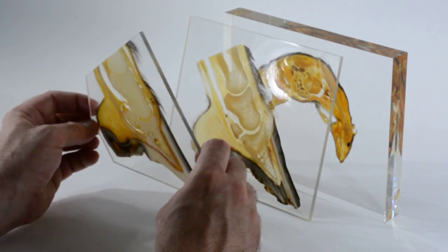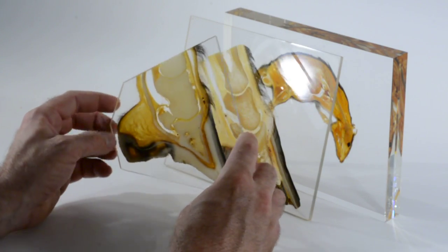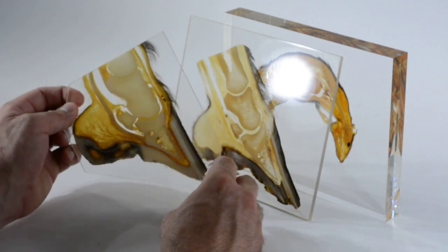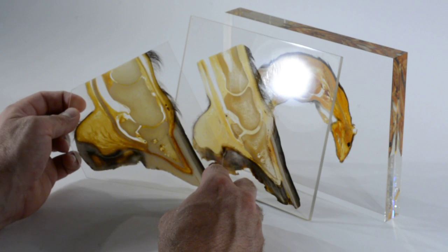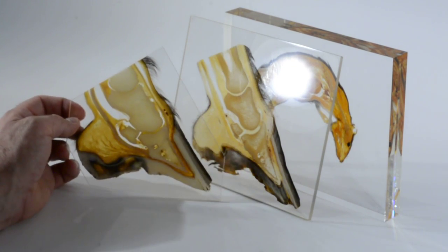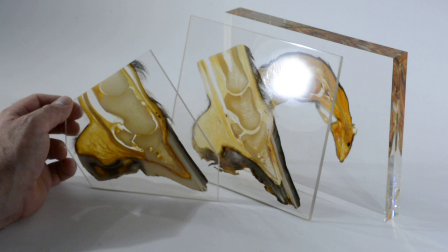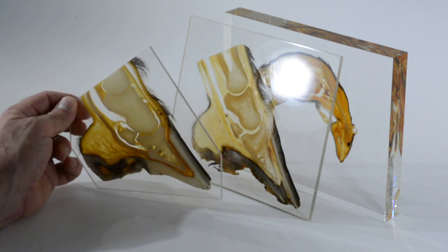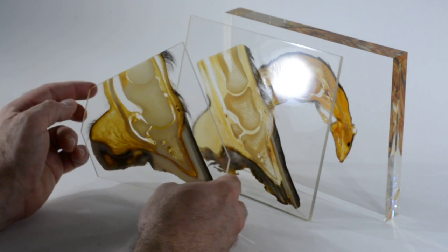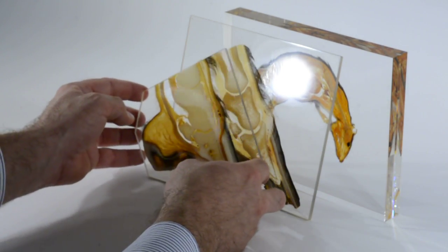Usually these are not cut in a rectangular shape, but as small as possible, because most people want to have them in their coat bag or in their jacket bag, and they want to use it for showing it to somebody and explain what the anatomy looks like in general.